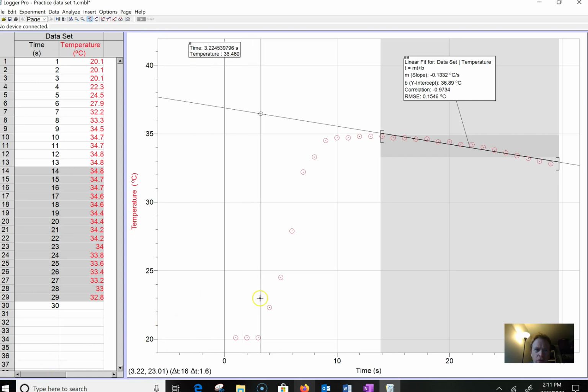So normally what we would do in this kind of experiment is find our delta T just normally. I would say, okay, there's my TI, find maybe the highest temperature I got to. Oh, that's the highest temperature I got to right there, and subtract them and get our delta T. But there's heat loss, right? In this case, since this is an exothermic reaction, that temperature should have climbed to some higher value if there was no heat energy lost.